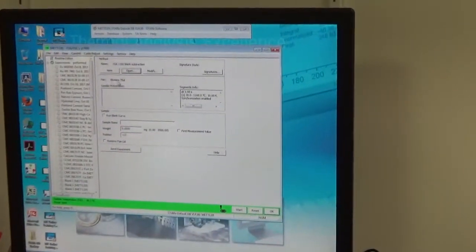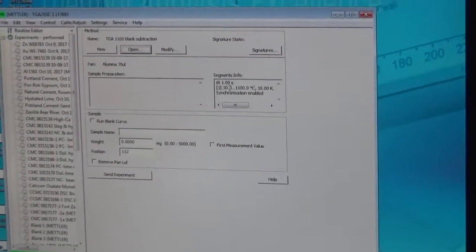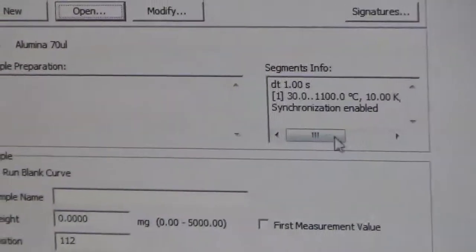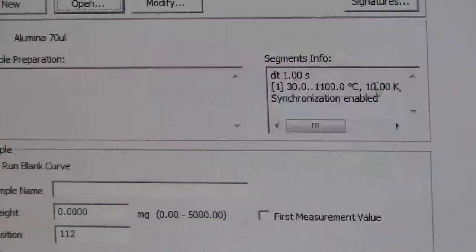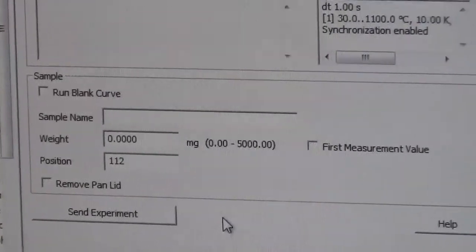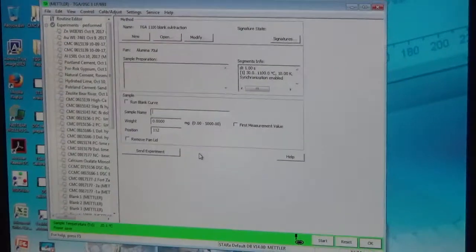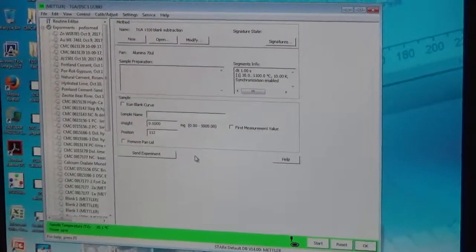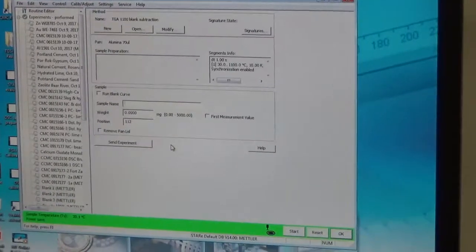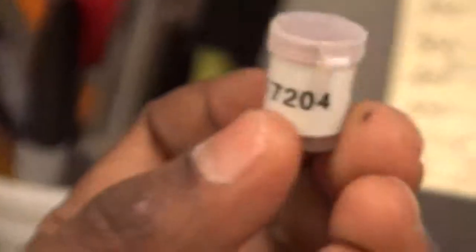If we open this method, it shows that we are using the alumina crucible, 70 µL, and it will go from 30 degrees — the ambient temperature — to 1100 degrees at 10 degrees Kelvin per minute. Here we give a name of the sample that we are analyzing. We will be running a sample from a CMC project — a historic mortar, a pigmented mortar that we will be analyzing with this TGA DSC method.